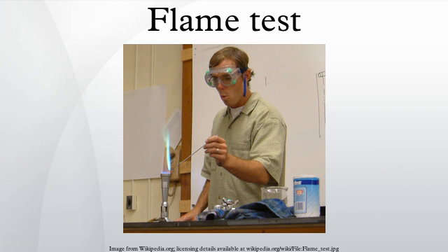A flame test is an analytic procedure used in chemistry to detect the presence of certain elements, primarily metal ions, based on each element's characteristic emission spectrum. The color of flames in general also depends on temperature. See flame color. The test involves introducing a sample of the element or compound to a hot, non-luminous flame, and observing the color of the flame that results.